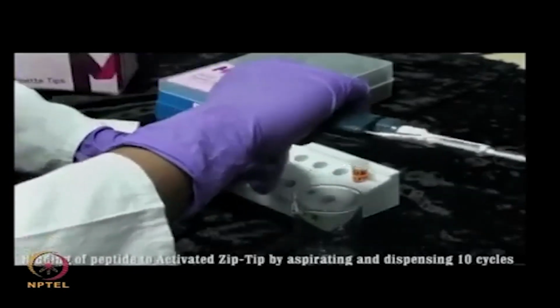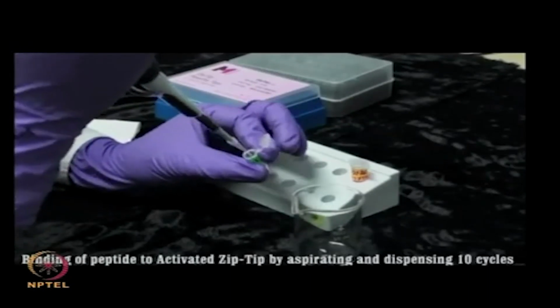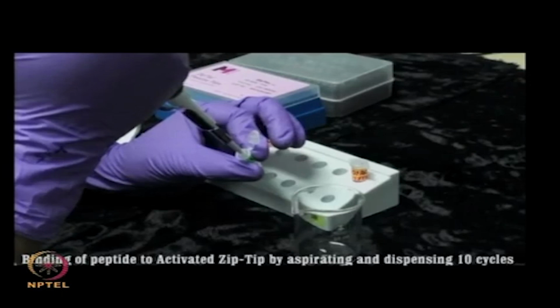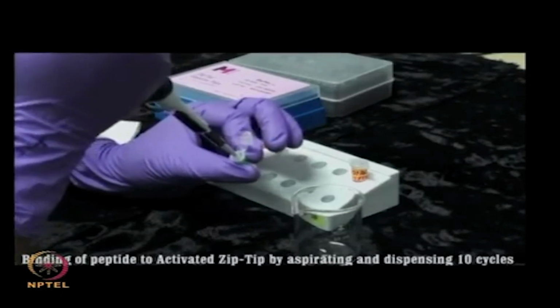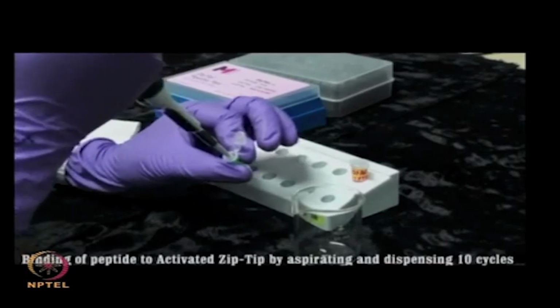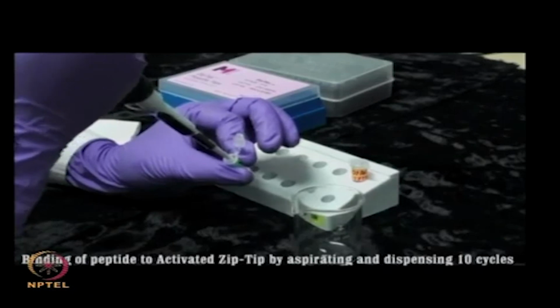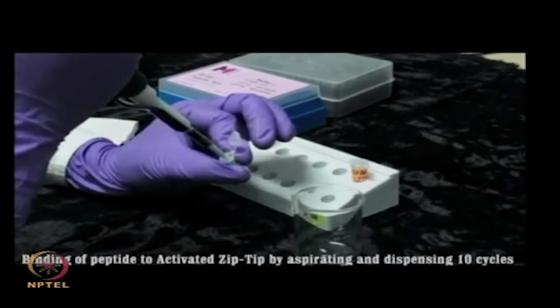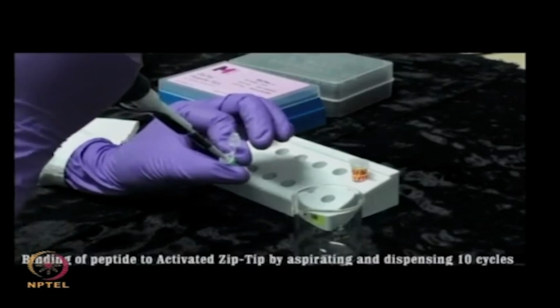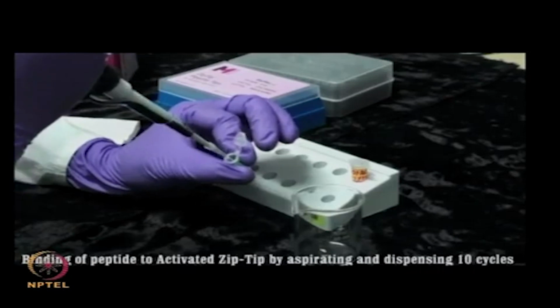Now, load the sample of your interest onto the zip tip by pipetting 5 to 10 microliter of sample, and this step has to be repeated 10 to 15 times. You can do the binding of peptides to this activated zip tip by aspirating and dispensing 10 cycles.